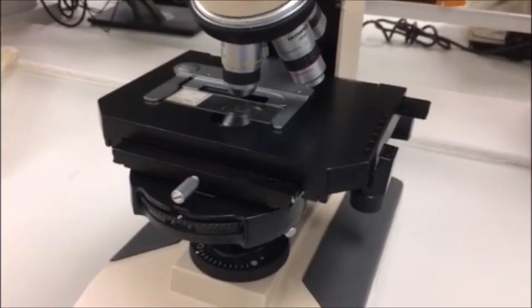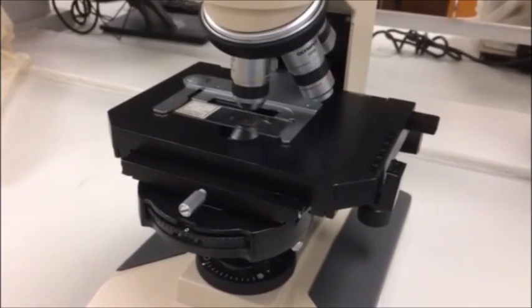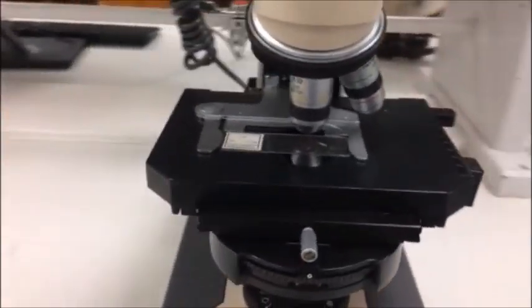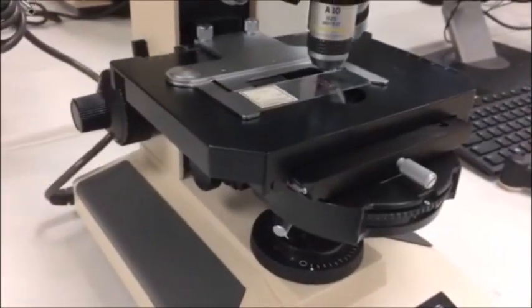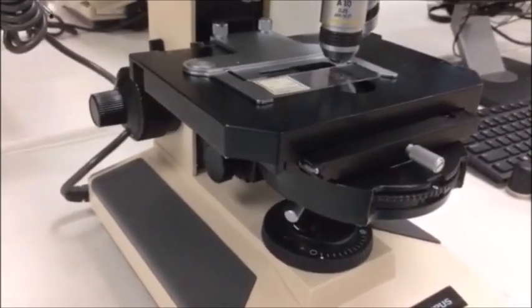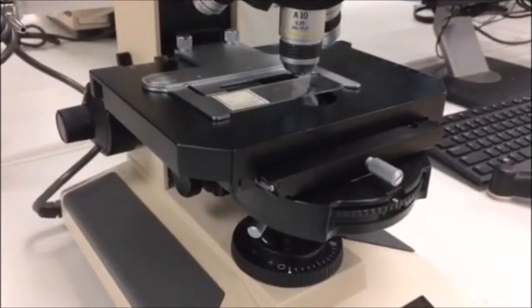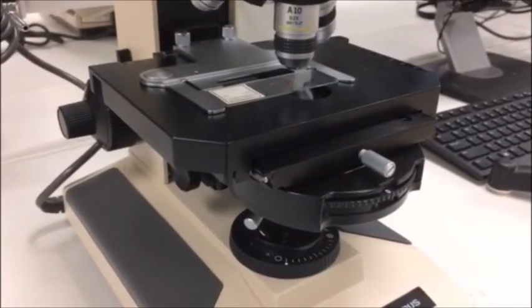So once you have the object in focus, you can then begin the condenser adjustment. It's really important that you actually get the slide in focus, because if you don't have the actual specimen in focus, it doesn't do any good to do the condenser adjustments because they just get messed up when you go back and focus on the slide.